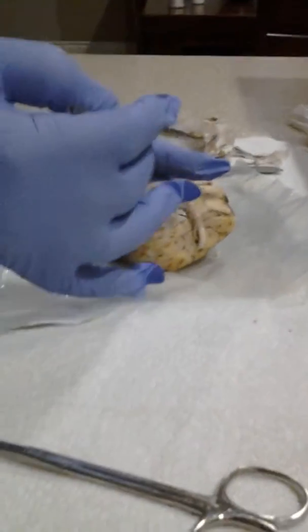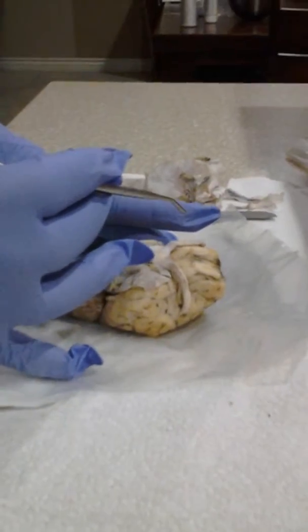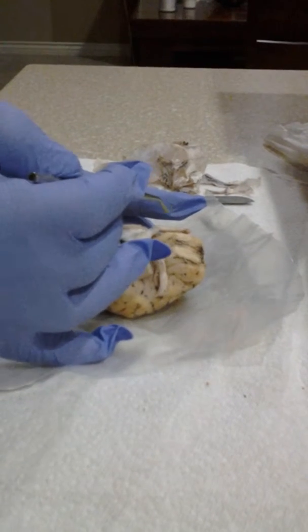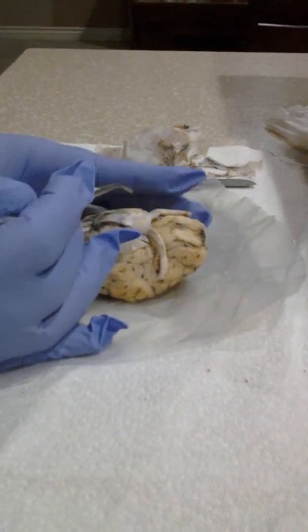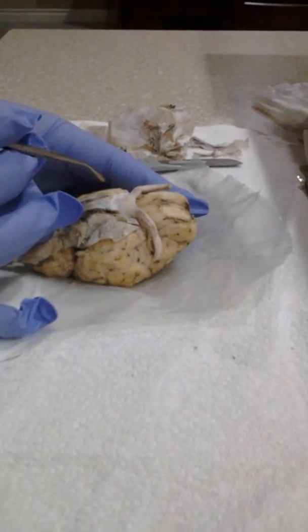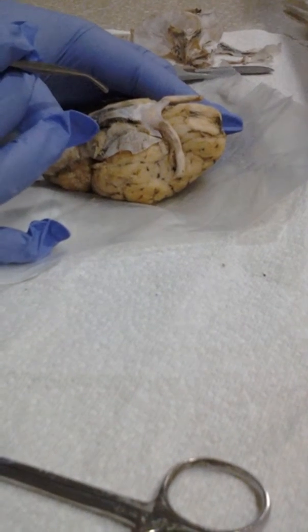Okay, over here on the top we have the olfactory nerve. And then we have the oculomotor nerve just below. Then below that is the trochlear nerve. Then in this area here would be the abducens nerve.